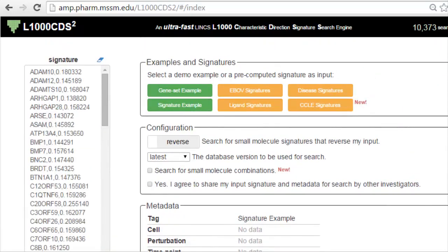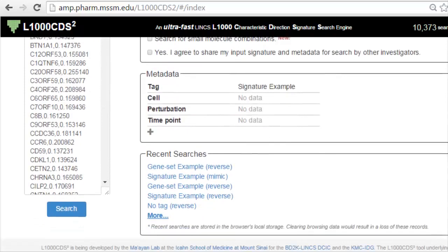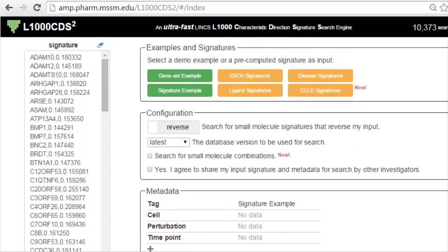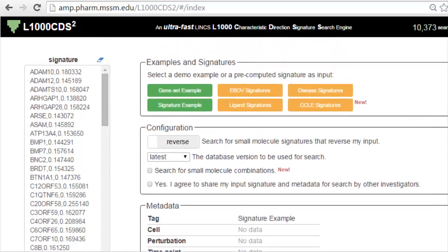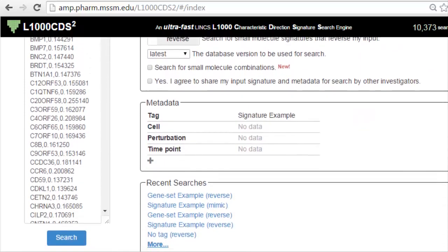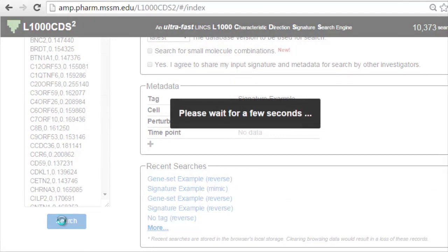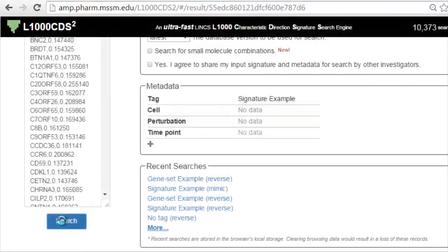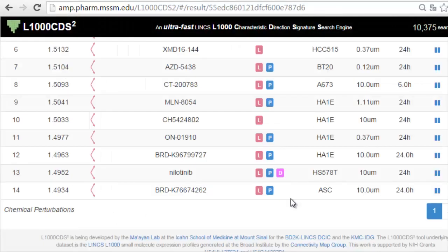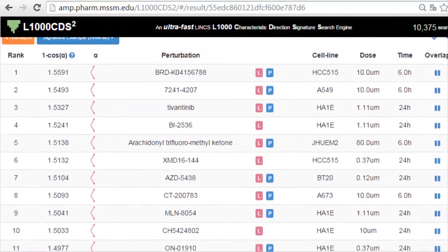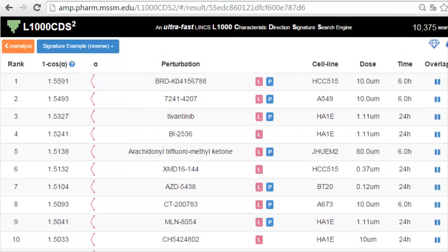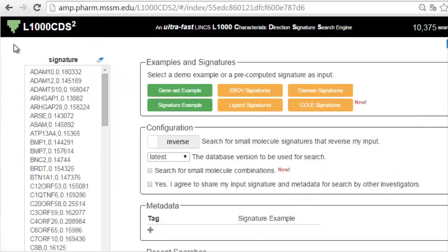The app comes with examples in the signature section which includes pre-computed signatures that the user can use as input. Clicking on the gene set example button will fill in an example of the up down gene list in the text boxes for a demo search using the gene set method. Clicking the signature example button will fill in an example of a signature.